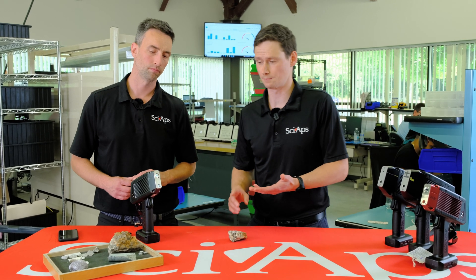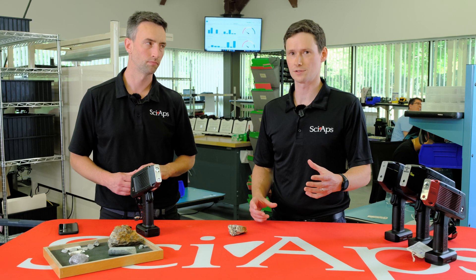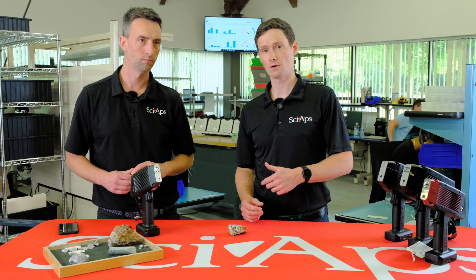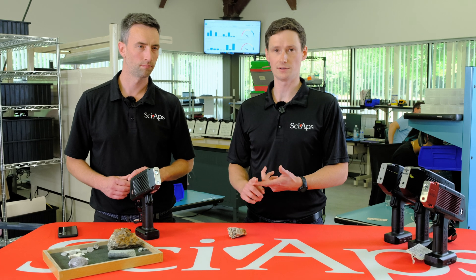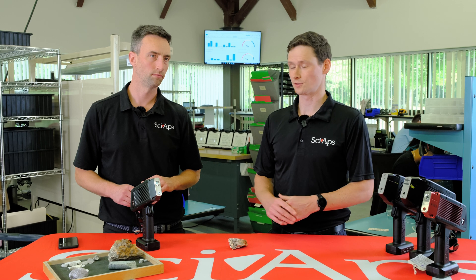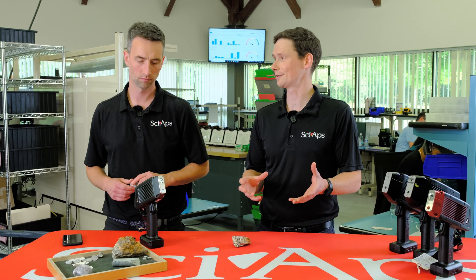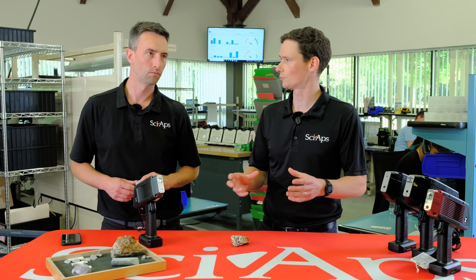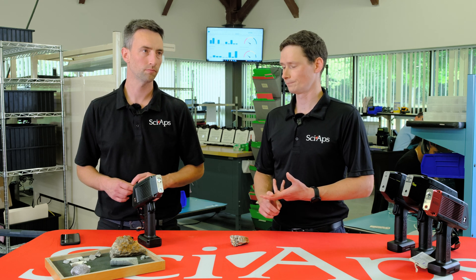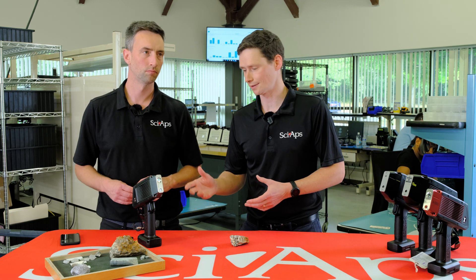In this model, the X505, we've got the top-of-the-line silicon drift detector. What that gives us is really good spectral resolution and higher count rates. With higher count rates you get better sensitivity, lower detection limits, and better statistics in general. With higher resolution, you can start to separate some of those peaks that overlap pretty severely. The 505 has a great detector and a really powerful tube — it's a real high-end portable XRF in a super small and lightweight package.